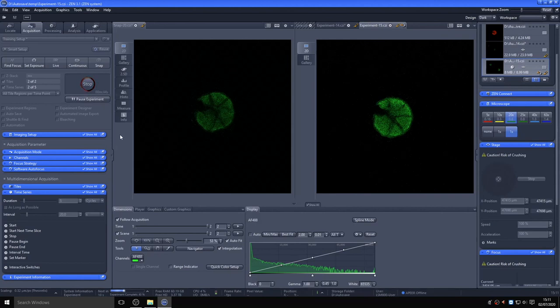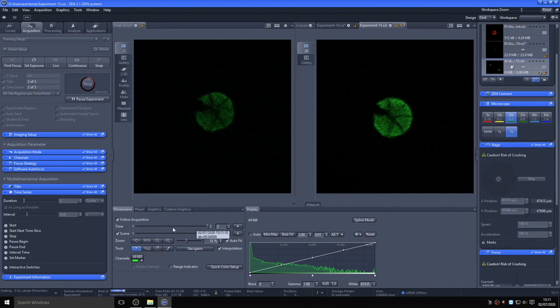In the finalized image file, you can now move between the different positions, also known as scenes, and at different time points by moving the appropriate sliders.